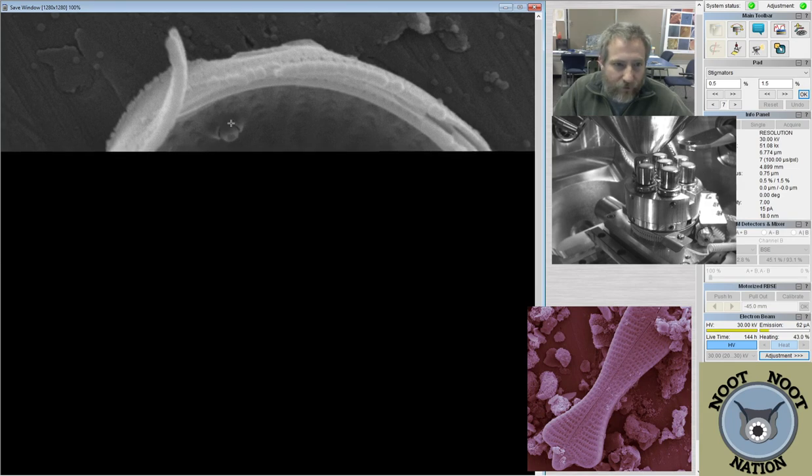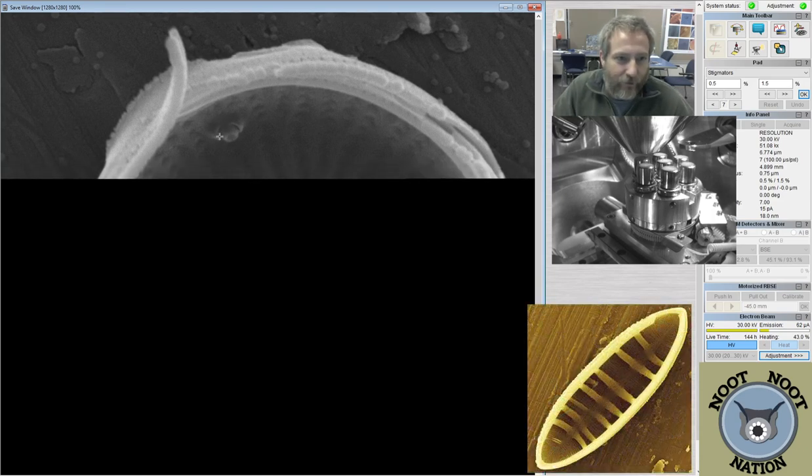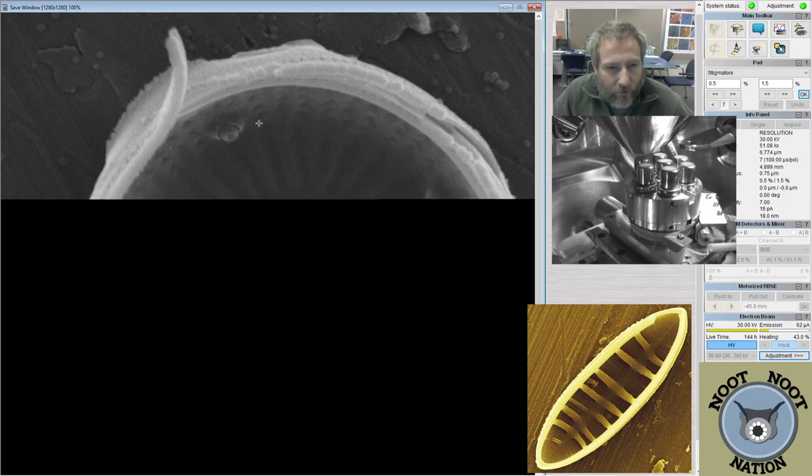You can see a lot of the detail from what I was doing. The central tube is this middle one. It looks a little bit like a tire valve. And then these two slit-shaped things on the sides that are associated with it.